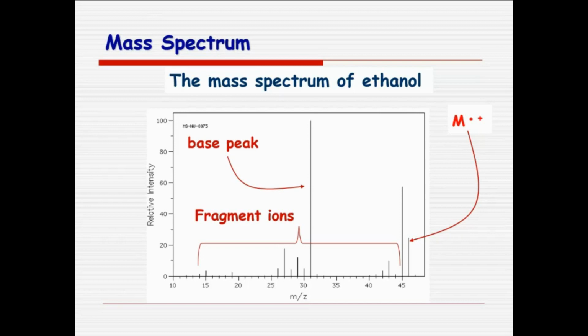So you have so many things. Mass spectrometry is like an ocean. You have techniques for ionization: EI, electrospray ionization ESI, chemical ionization, MALDI, and FAB, fast atom bombardment. These are segregated as hard and soft ionization techniques, depending upon the energy you use. If I bombard with electrons of high energy, that is a hard technique. If I use a soft, mild gas for ionization, that is a soft technique. It depends on which technique you use.